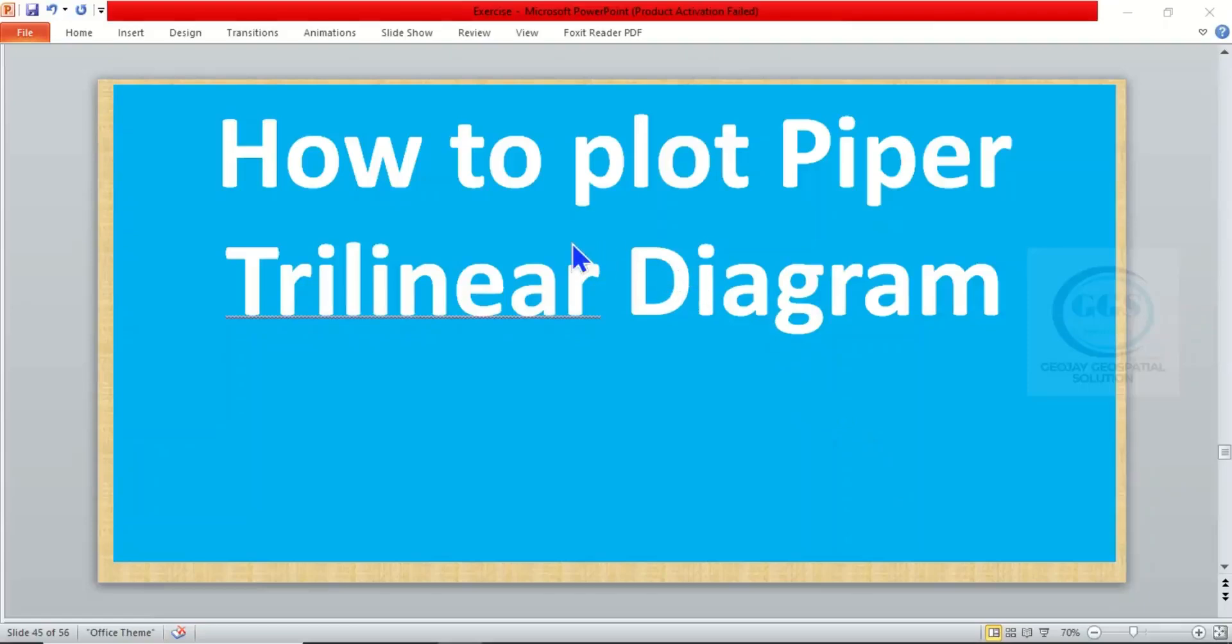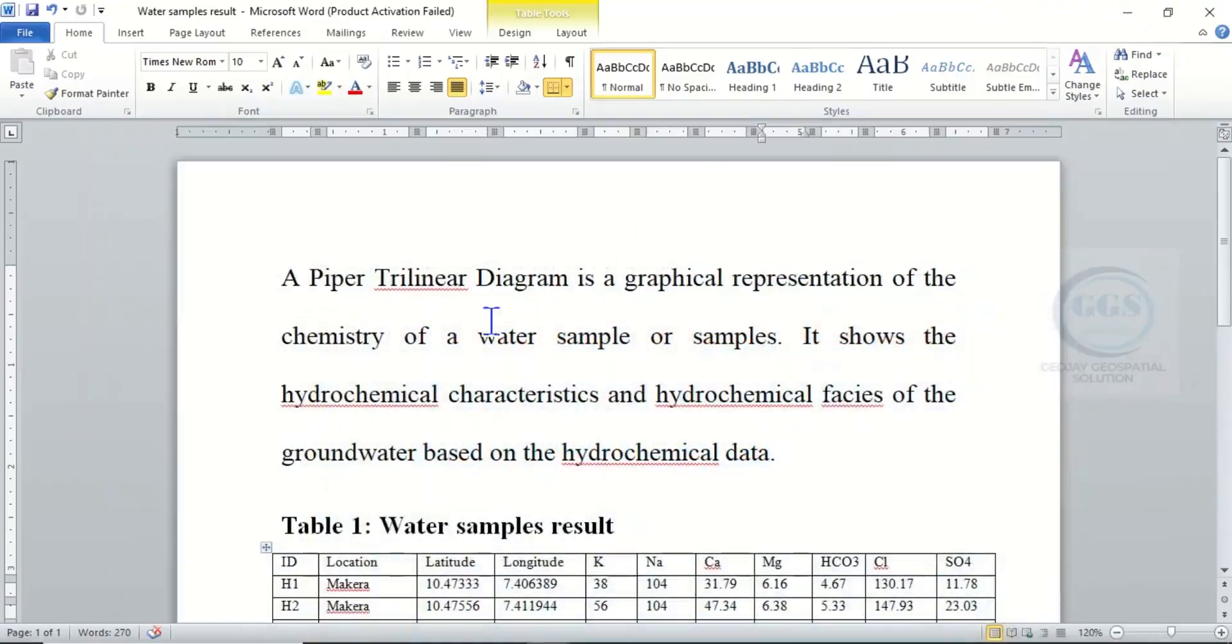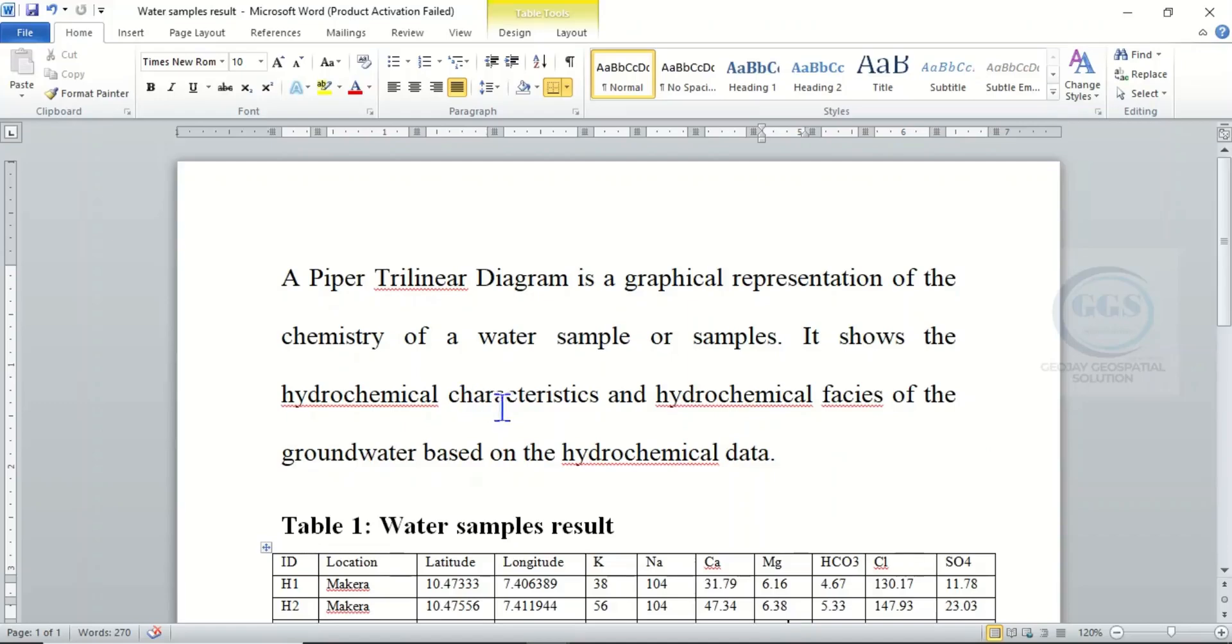In today's tutorial, I want to show you how to plot Piper trilinear diagrams. A Piper trilinear diagram is a graphical representation of the chemistry of water samples. It shows the hydrochemical characteristics and the hydrochemical facies of groundwater.